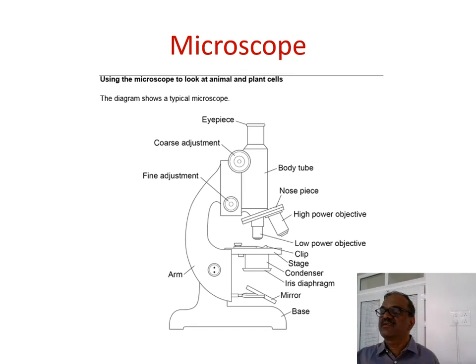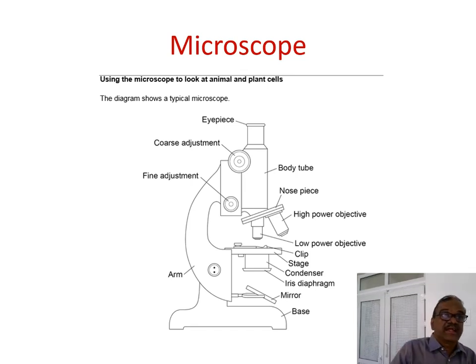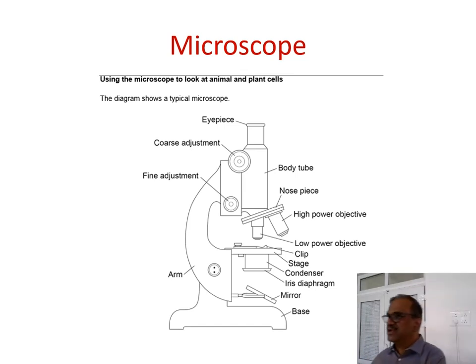But later they thought it was not enough, because Antony van Leeuwenhoek himself said 200x magnification is possible. So another lens is to be used. Here 10x with another 10x gives 100x magnification. With an eyepiece of 10x and an objective of 20x, you get 200x magnification.